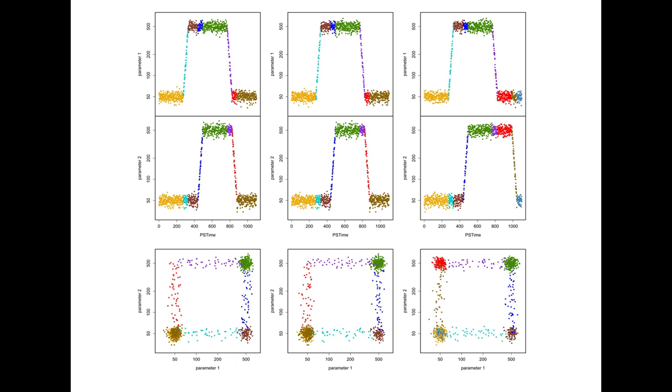For example, the 2 stable minima at the beginning and ends of the time sequence are ochre and brown. They are represented in the bottom bivariate plots in the first cluster in the lower left. The sharply rising expression of parameter 1, cyan, is correlated with expression of parameter 2 at a stable minimum, also cyan.